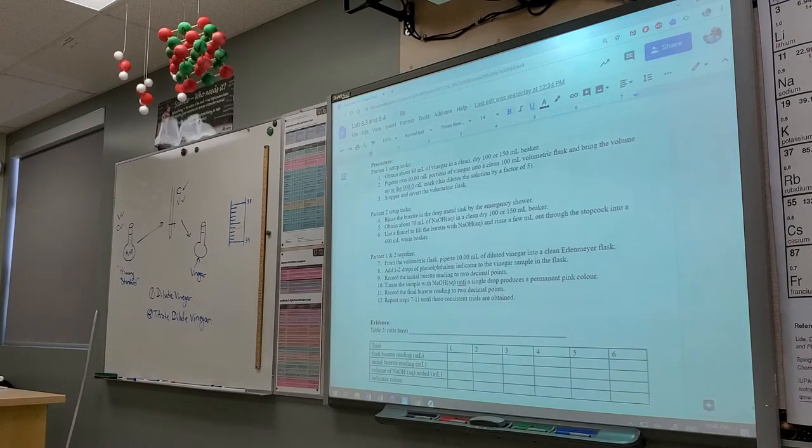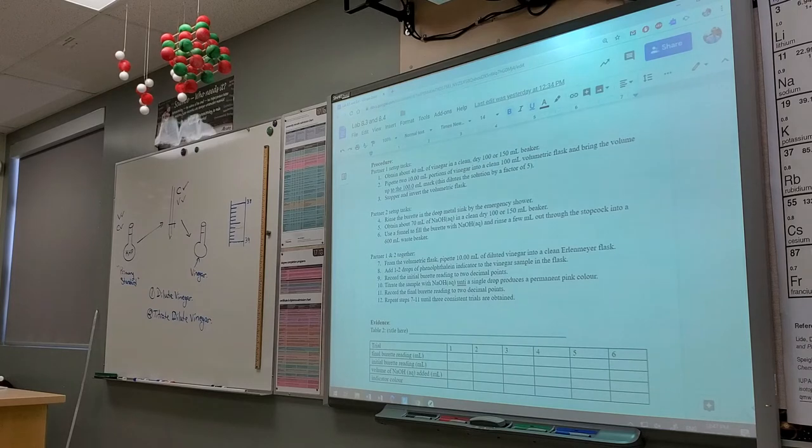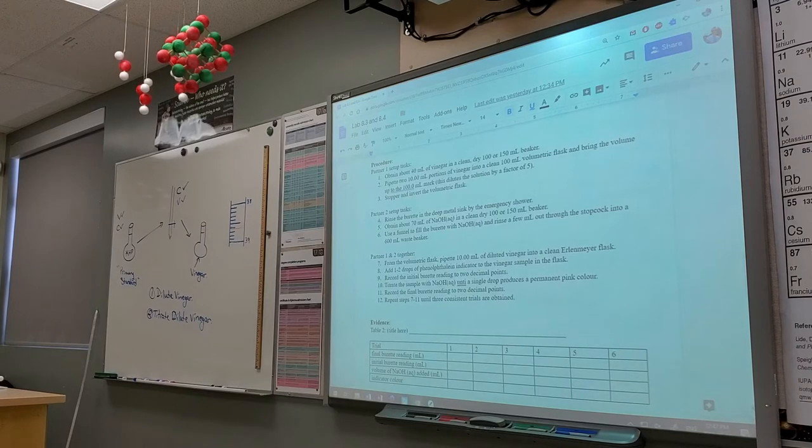I saw a couple groups rinsing it with water and then putting sodium hydroxide, but the problem with that is there's a bunch of water in here, way down at the bottom, and so you're diluting your concentration of sodium hydroxide.